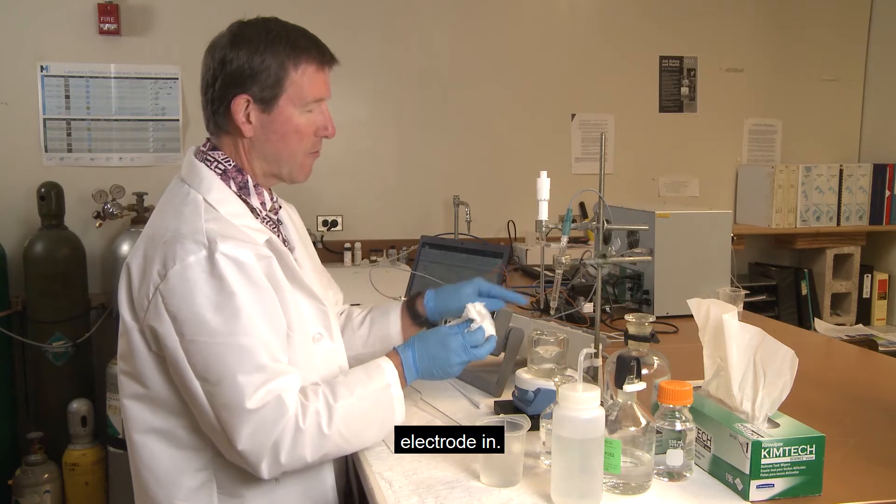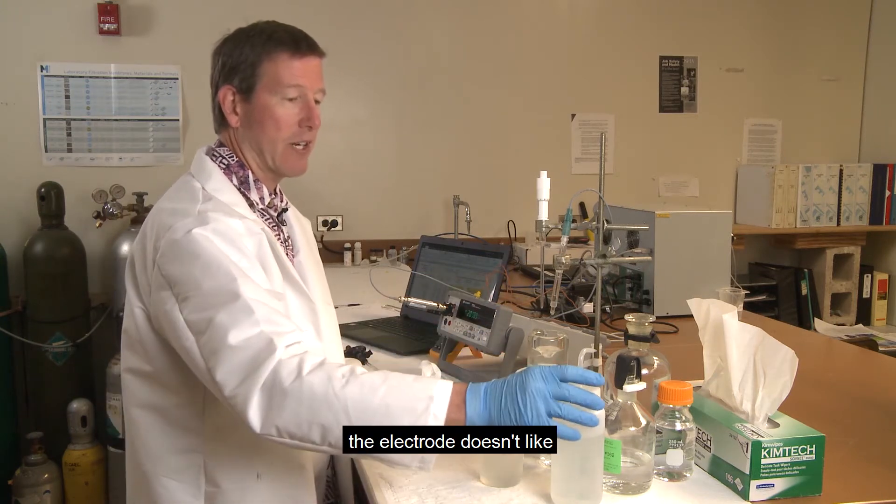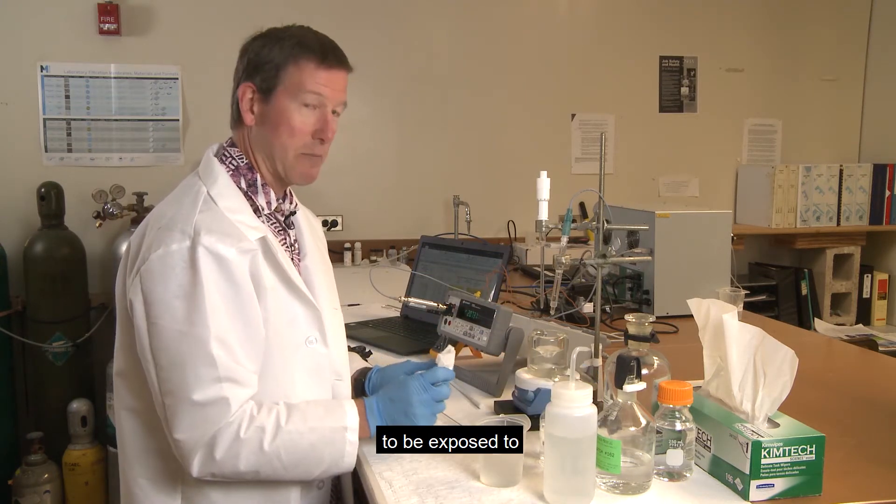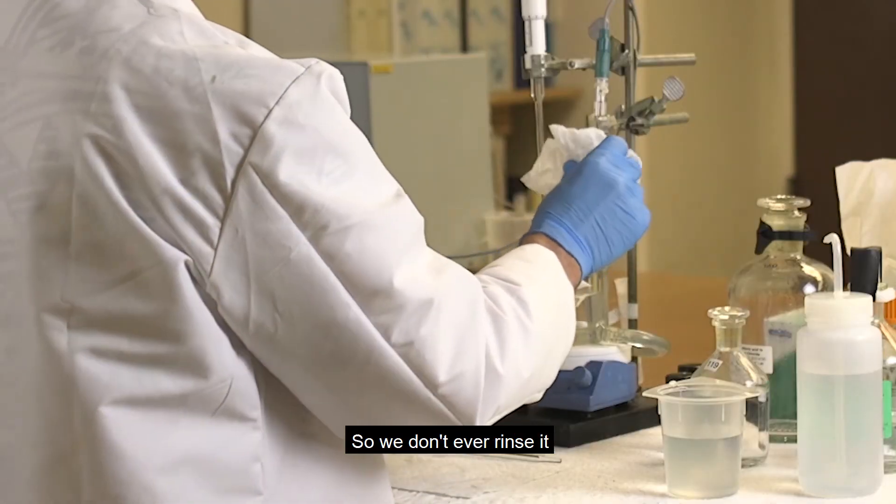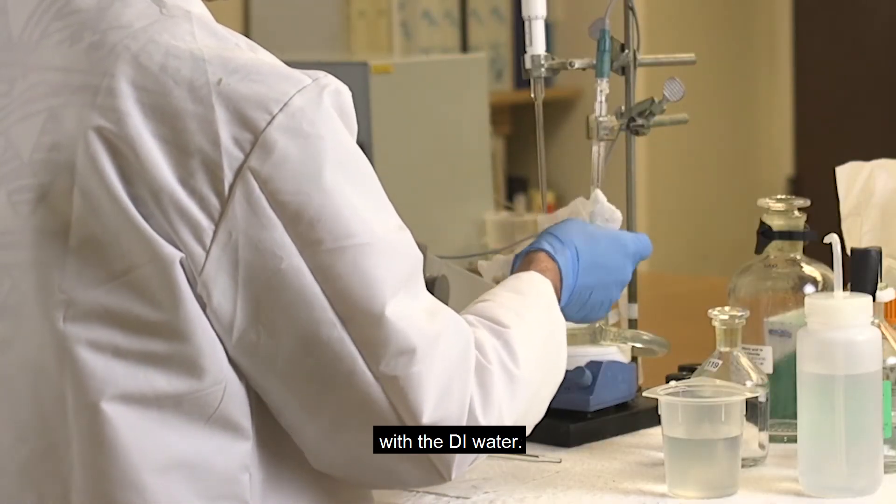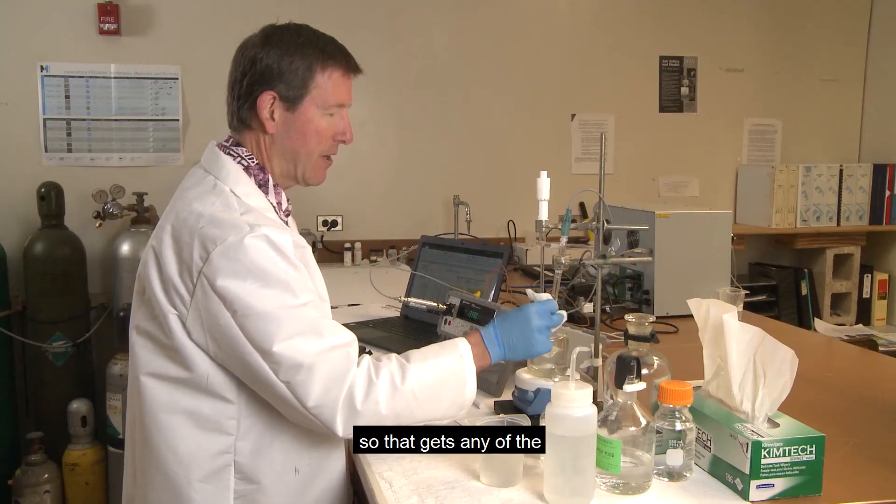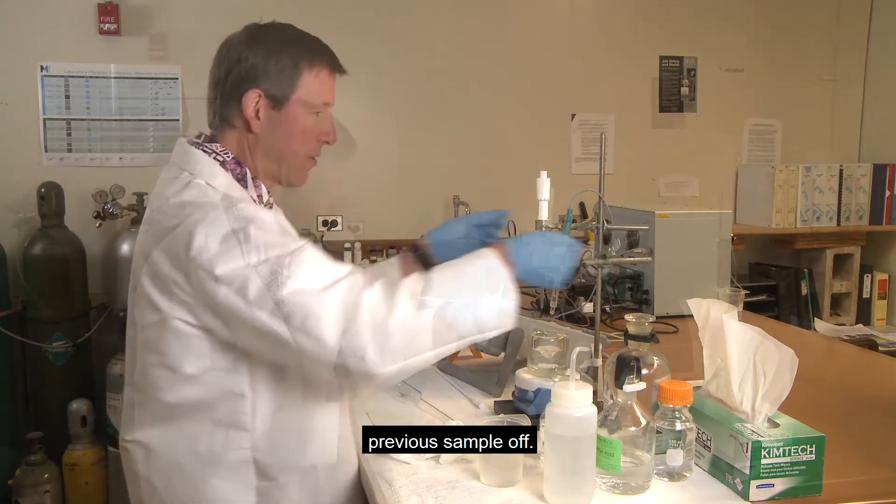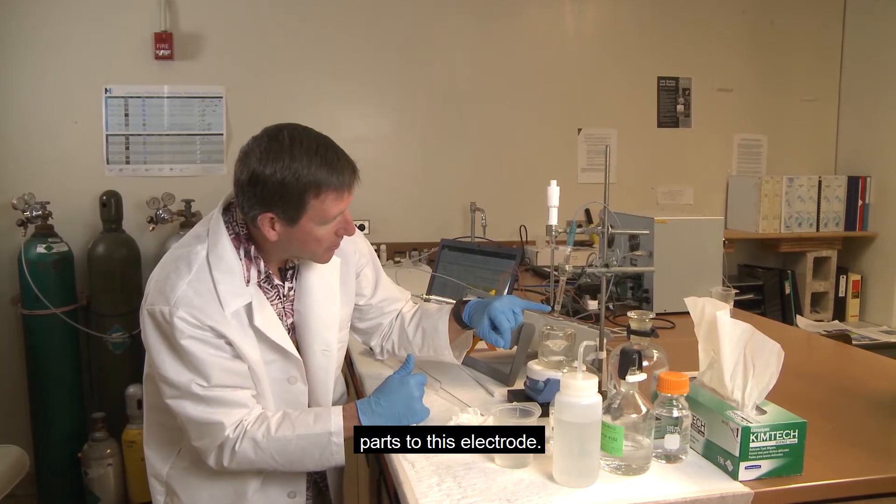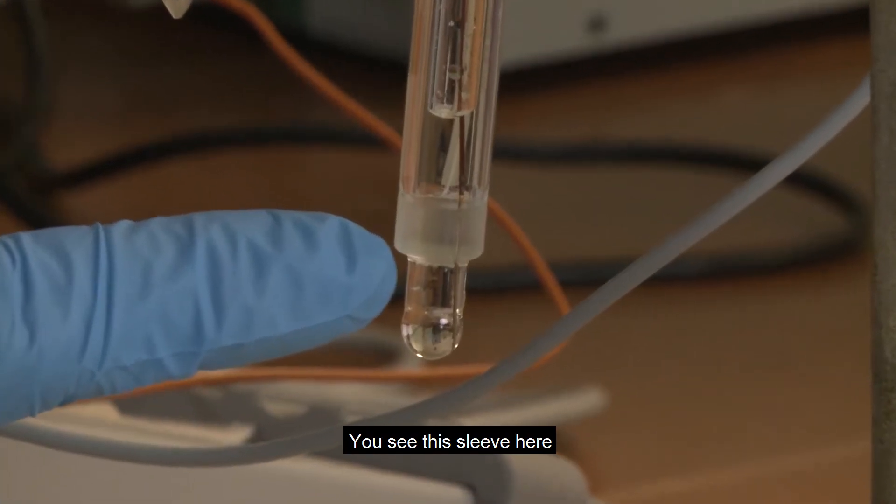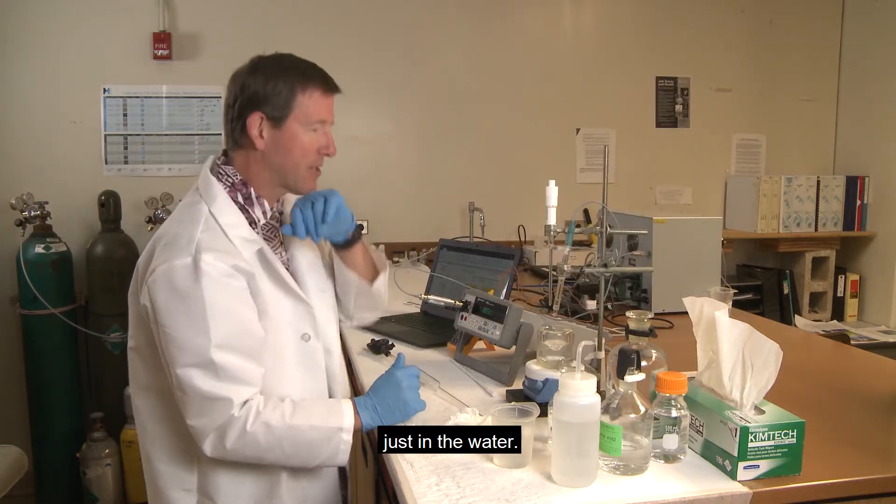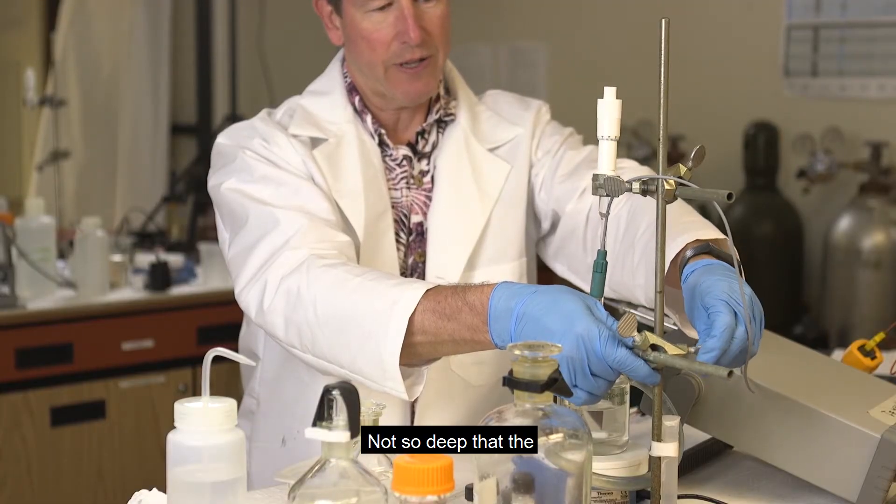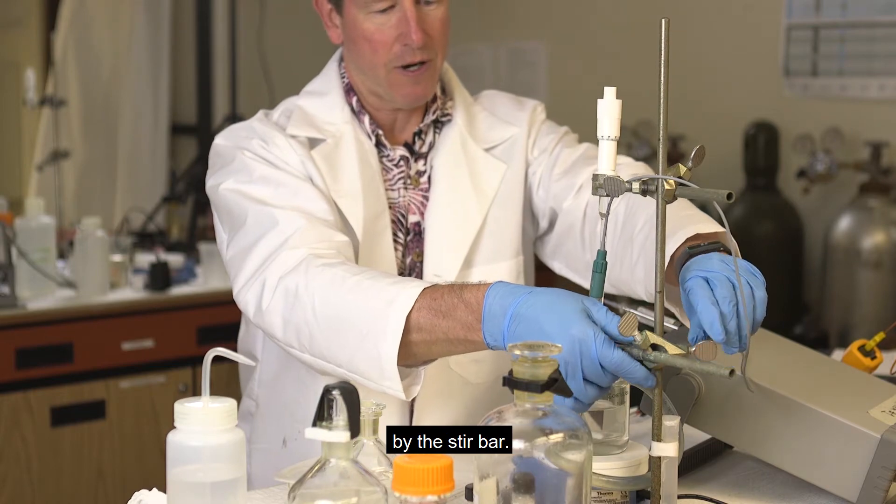Now we're going to put our electrode in. You don't rinse the electrode because the electrode doesn't like to be exposed to different salinity waters. So we don't ever rinse it with the DI water. You just pat it dry so that gets any of the previous sample off. So there's two parts to this electrode. You see this sleeve here, that's the second part of the electrode. So that needs to be just in the water, not so deep that the electrode is being hit by the stir bar.